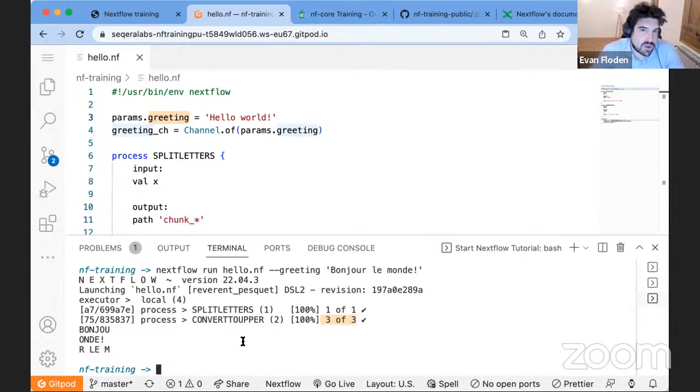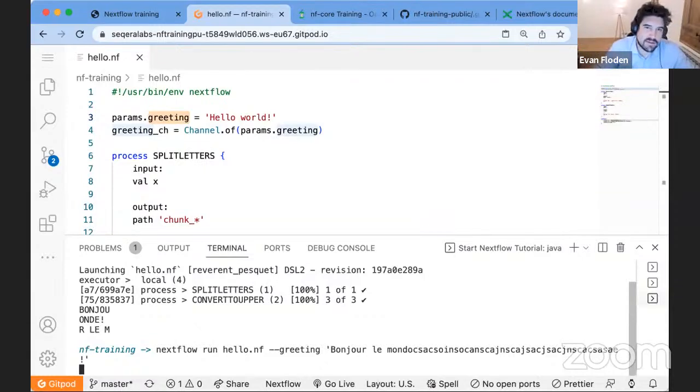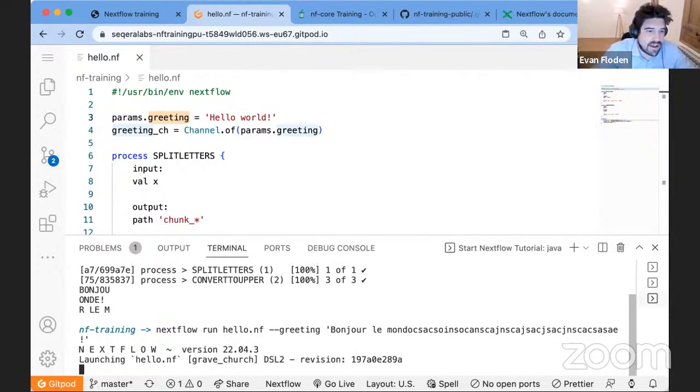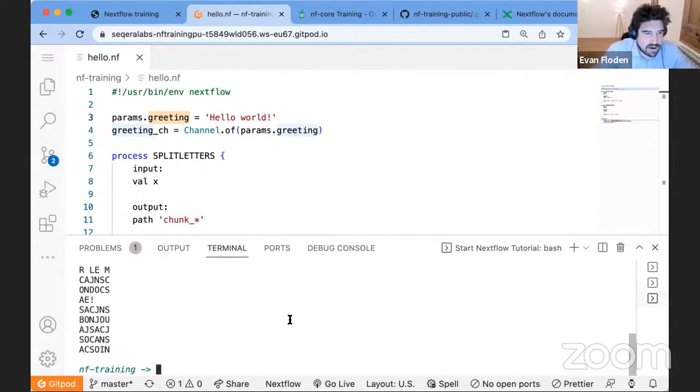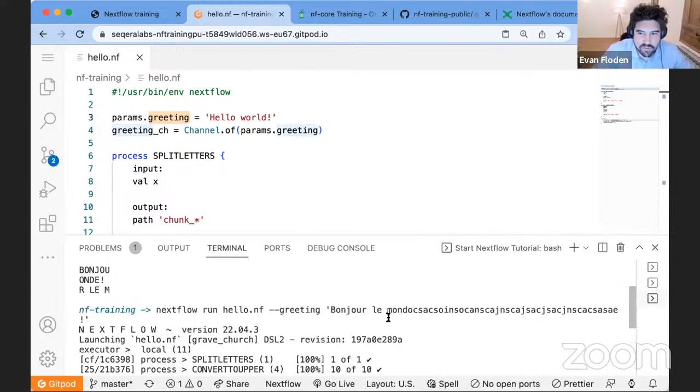And this again is showing a little bit of the data flow parallelization. So if I was to do the exact same thing, for however many times that I can split, in this case, however many files I'm creating, or how many files I'm starting with, I'm ending up with this parallelization. And here you can see we end up with 10 tasks being run for that as well. So something that's, again, useful for driving that forward.